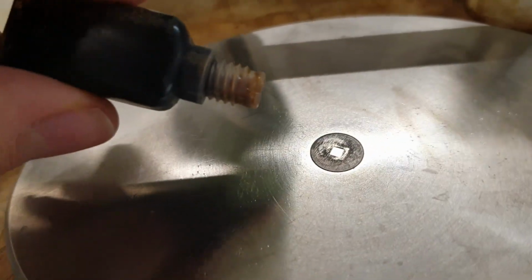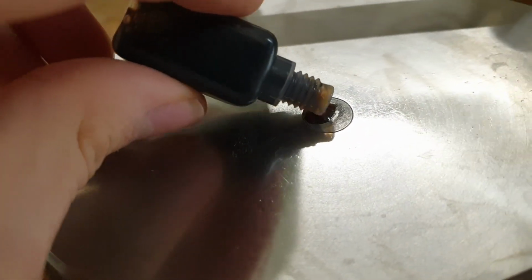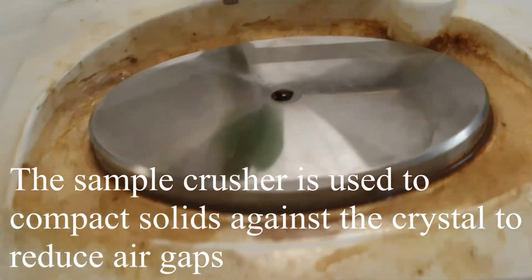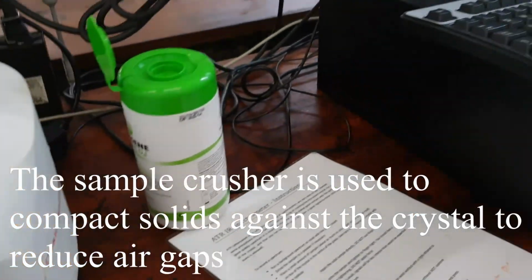we're going to add the sample to the crystal. So we've got some soy sauce here. So we're doing IR on soy sauce. We don't need to put the crusher on it because it's a liquid. It covers the crystal. You only need the crusher for solids.